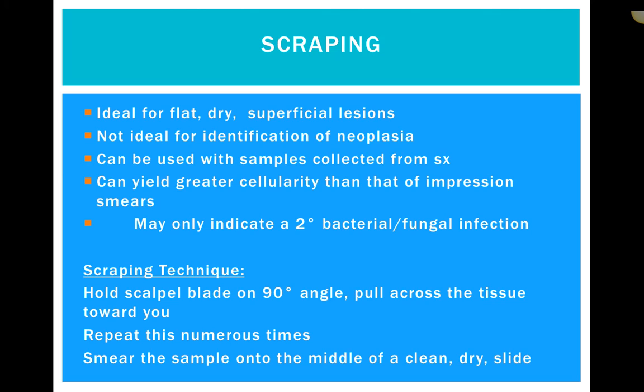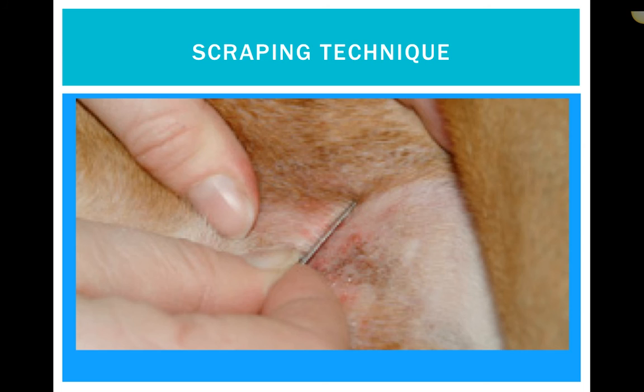You can see here — scraping at a 90-degree angle, pulling the blade toward you across the skin. Going back to the scraping technique: we also use this on excised organs using exactly the same technique. However, you normally only need to scrape once across, because you yield an excessive amount of cells, which doesn't smear well onto a slide if you have too many.